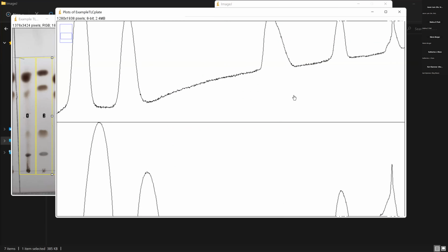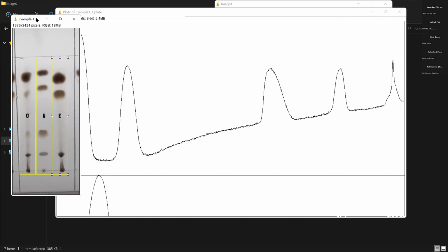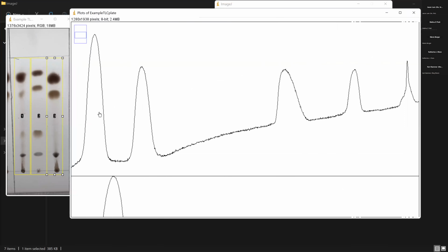So the standard helps us identify which peaks are in there. You can see here, so this dot here at the very top, this darker one, is going to correspond with this peak here. Can everyone kind of see when I'm using my cursor, that's what I'm pointing to?